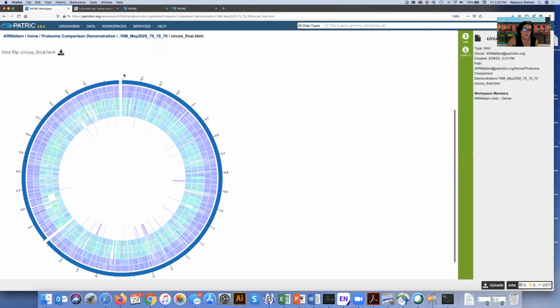Now you may be wondering what is going on here and here with this break. It starts at 0.1 and then it starts at 0.1 again. What's going on? Brucella melitensis 16M is a closed, complete genome.